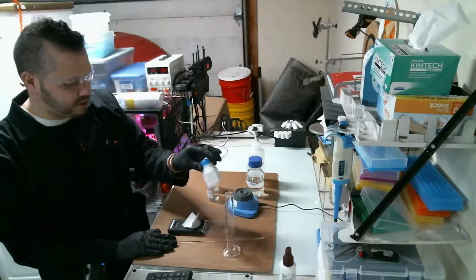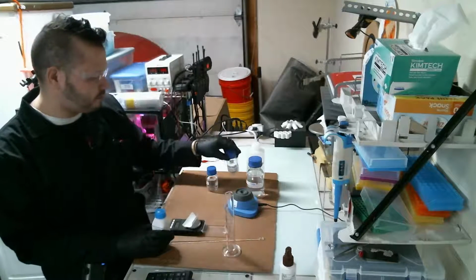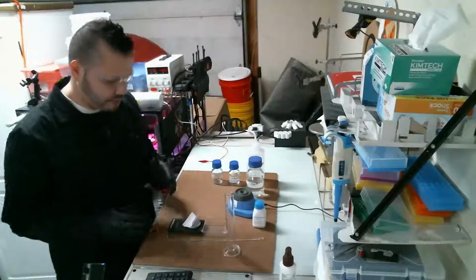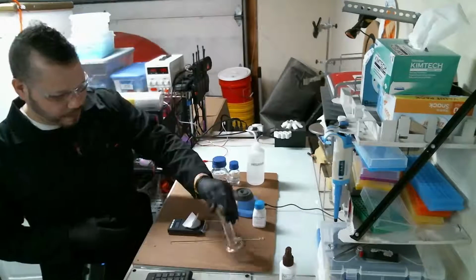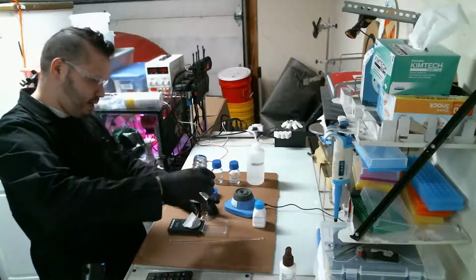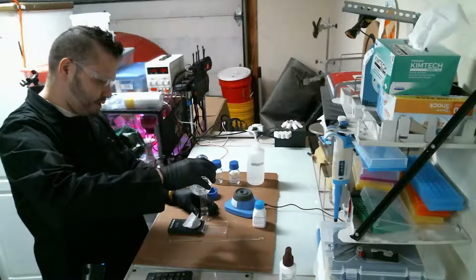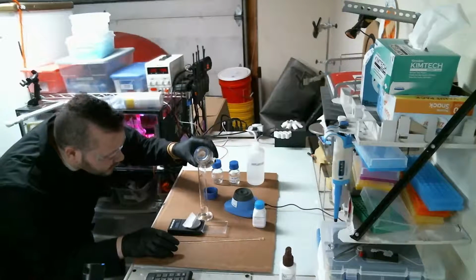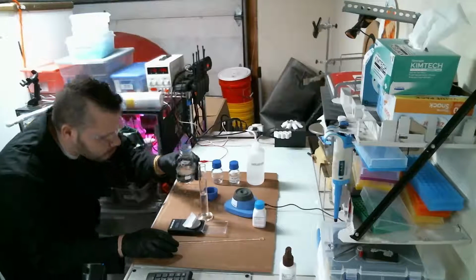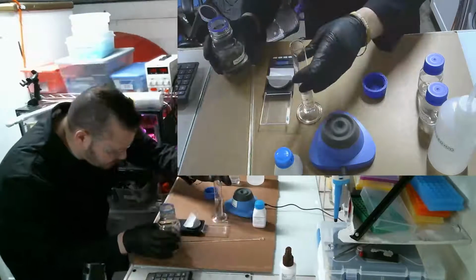What I'm going to do is dissolve it in a 50 milliliter solution of sodium hydroxide. But I'm also going to explain what the experiment is. A little backstory: there are a couple of researchers in India who did a study on indole acetic acid's effect on spirulina algae growth, and they found that it can be used essentially as a way to promote the growth of the algae.